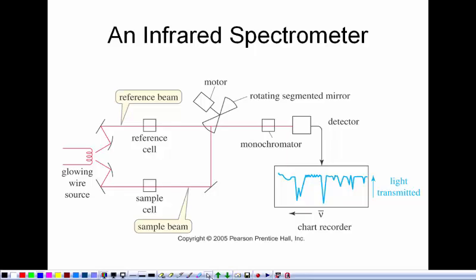There's other parts of the infrared region that we don't have the instruments for, like Raman and some other near-infrared techniques, but we're just going to deal with the straight organic infrared. So that's how the instrument kind of is laid out. Now, let's see if this works.